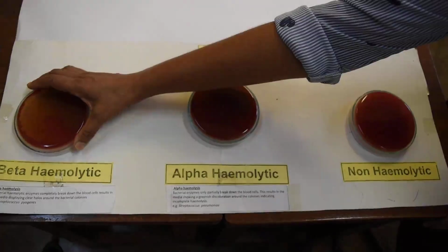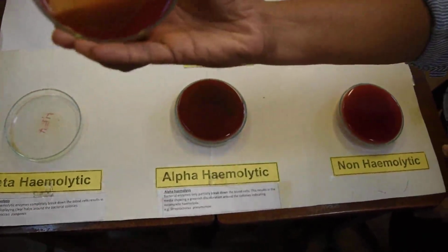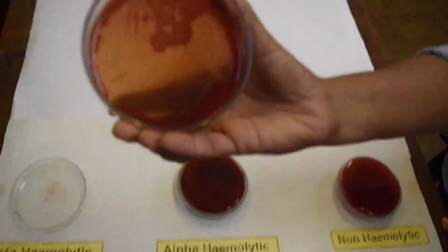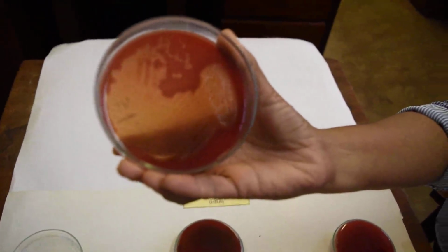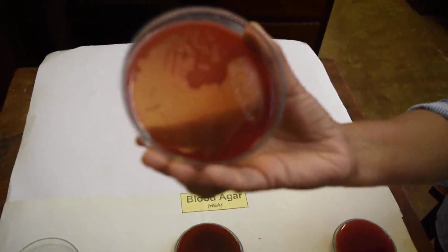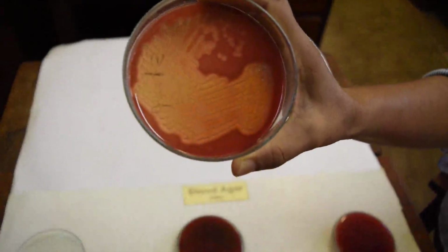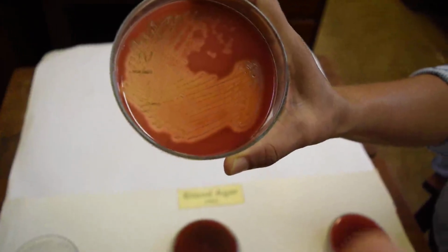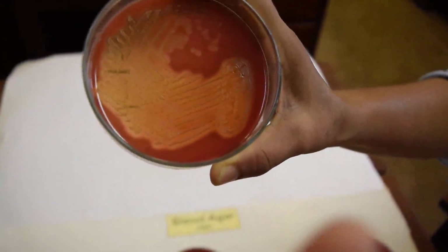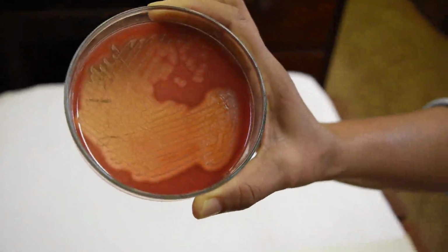Now if I show this plate to you, can you see the pinpoint colonies? Most of the streptococci have very small colonies compared to the staphylococcus colonies.